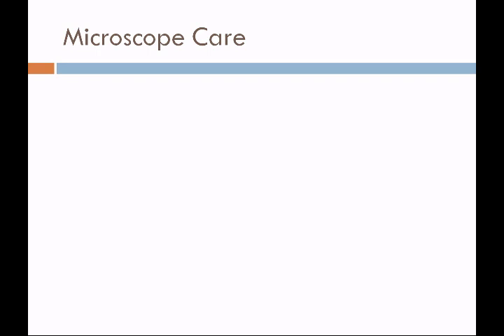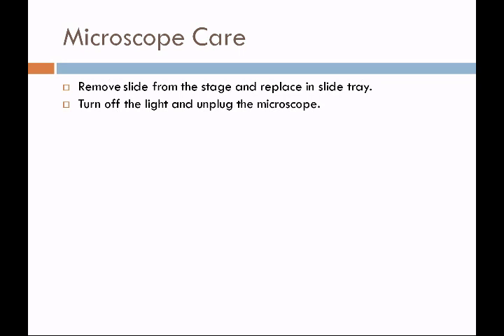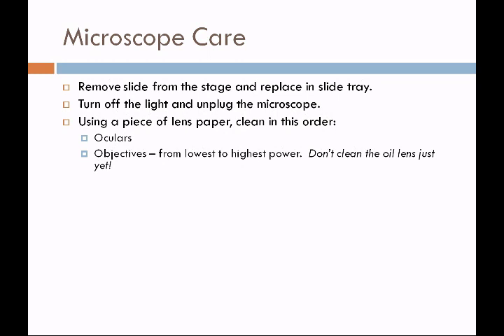When done using the microscope, it's very important to care for it properly — these microscopes cost thousands of dollars. First, remove your slide from the stage and replace it in the slide tray; if there's oil on it, remove the oil with a tissue. Turn off the light and unplug the microscope — this will extend the bulb life, as the bulbs are very expensive and difficult to change. Using a piece of lens paper, clean the microscope from the top down: start with the oculars, then the objectives from lowest to highest power — but don't clean the oil lens just yet. Next, do the condenser lens, followed by the stage. The oil lens is going to be cleaned last.